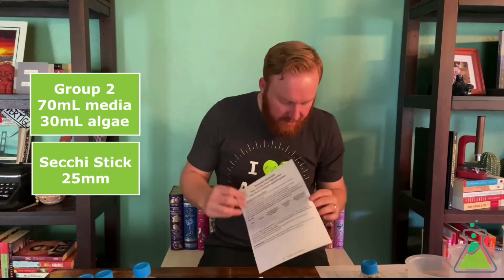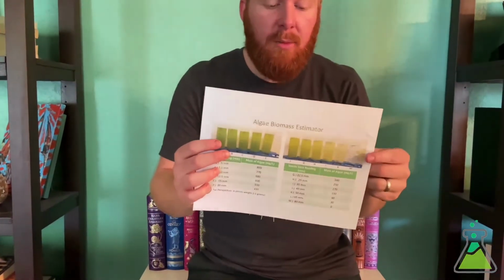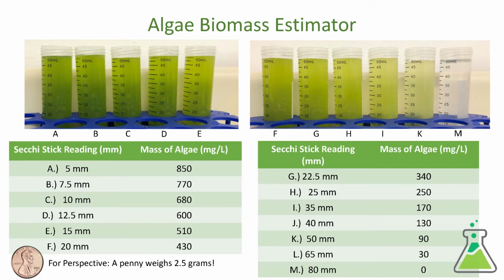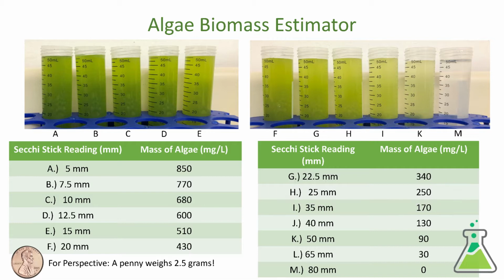So the next box is asking us the amount of actual biomass in your flask. How much algae is there? And so to get that number, we're going to use our algae biomass estimator tool. And so what's nice about this is you can use the Secchi stick reading, which is in the left column here, and that will help you estimate the amount of algae that is in your culture. So we just need to look down the left side here of these columns, and what we're looking for is our Secchi stick reading, which was 25 millimeters. And so perfect, right here, 25 millimeters. And so if we look in the box next to it, that means there is 250 milligrams of algae per liter of our culture. And so there we go. We'll go ahead and write 250 down on our worksheet for that.